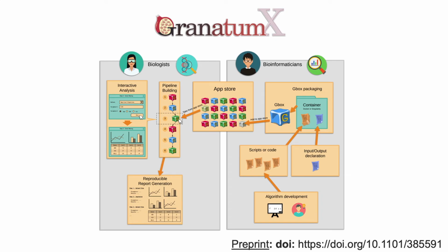Of course, for bioinformaticians who are interested in embedding their single-cell RNA-seq specific method within our platform and pipeline, they will be able to do so through the Gbox configurations. For more details on that aspect, please refer to our preprint here. The link is listed here. I will not talk in details about this in this video.